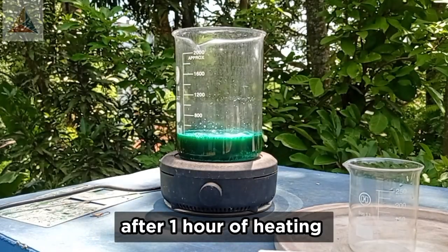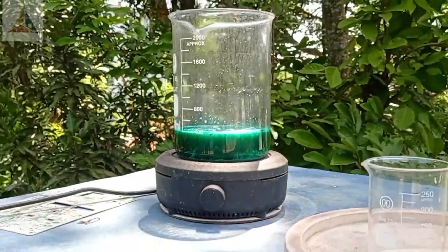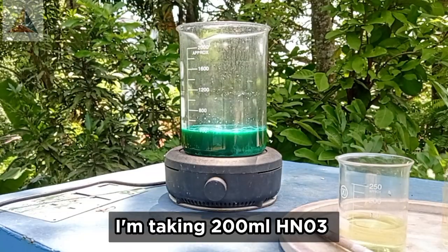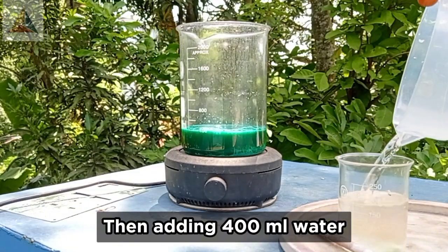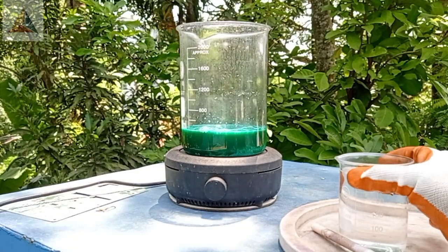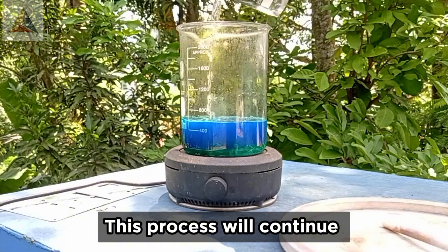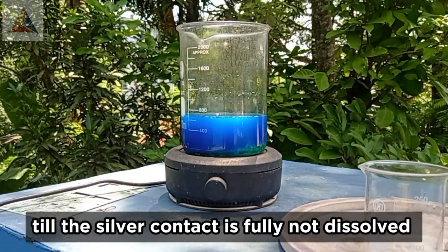After 1 hour of heating, I'm taking 200 ml HNO3, then adding 400 ml water, and adding it into the solution. This process will continue until the silver contact is fully dissolved.